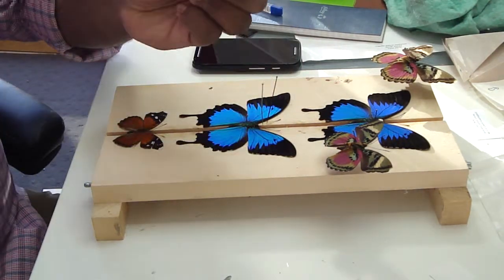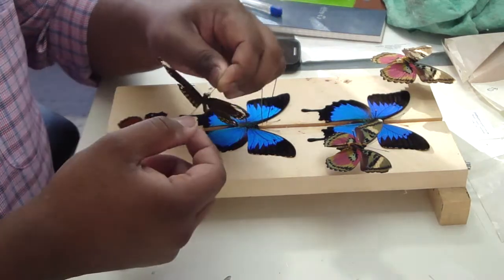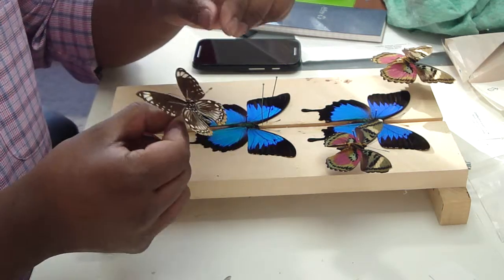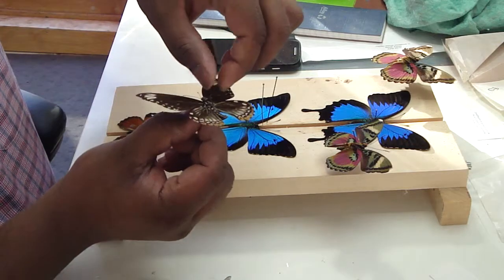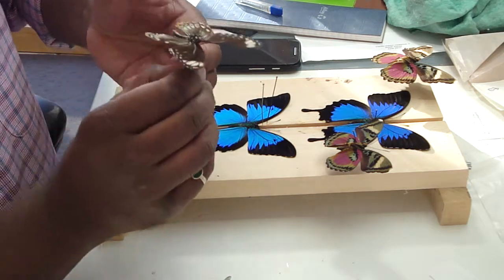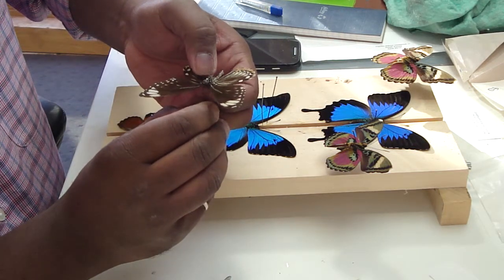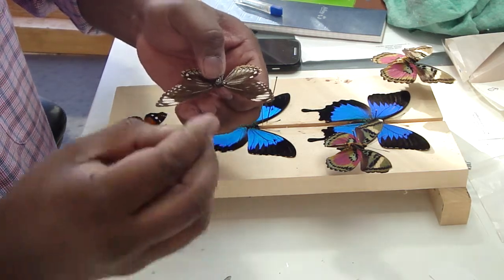So let's say we wanted to show the verso side of this butterfly, showing this side. What I would do is I would move the pin all the way up to the top. And then, with my thumb and my pointer finger, I would grab onto the thorax and take the pin out.